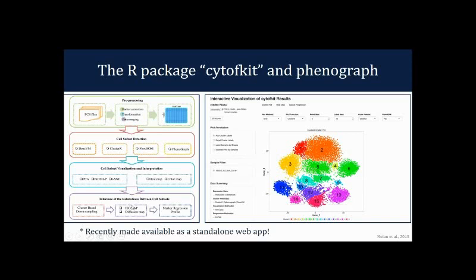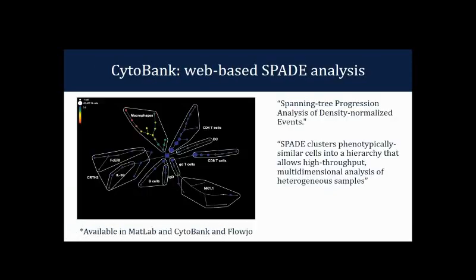We then have a series of relatedness or hierarchical analysis tools, which, I will be honest, I don't use a lot of those in CyTOF Kit. They tend to be very computationally intense. And so what we actually use for those is another program, which I'll briefly run over in a moment. But I do also want to note, I just found this out as I was preparing this presentation, CyTOF Kit is now available as a standalone web app. So this runs in Java on your web browser, and this makes it even more handy to use. It really streamlines the process.